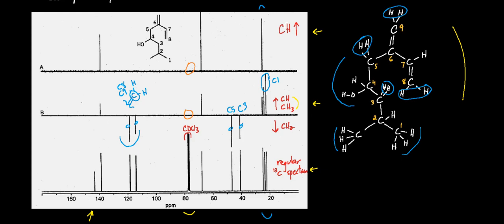But again, that's pretty much hand-waving and not direct evidence, right? So it should already be unsatisfying, even though we're looking at more information, that we can't nail everything down perfectly. And that's really the goal of this class, actually: more and more sophisticated techniques in order to distinguish, for example, C5 from C3, C8 from C9, and the 2 methyls at C1.